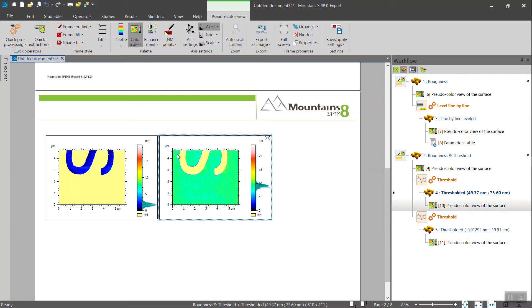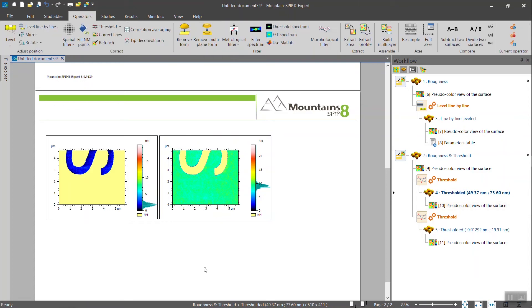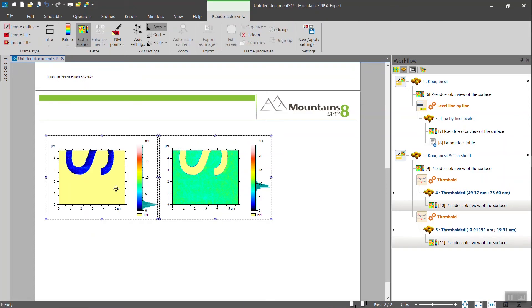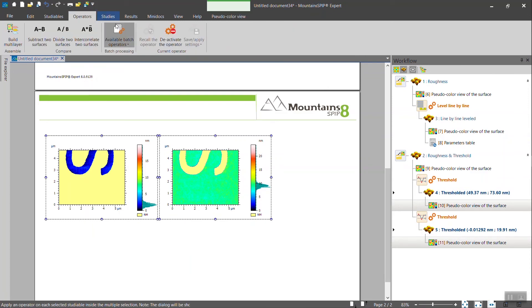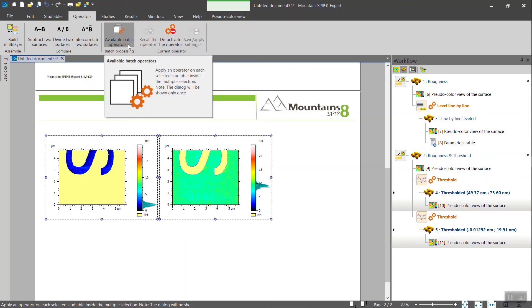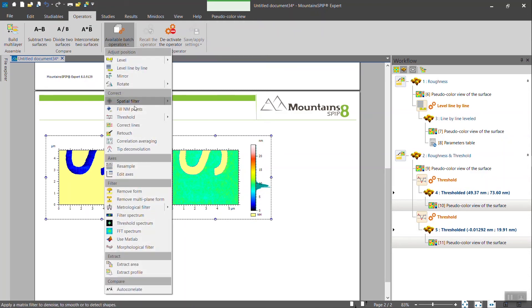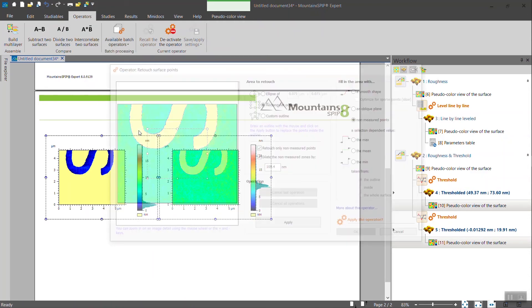To do so, we will use the retouch operator. Operators can be applied on multiple data selected in the workflow or in the document. So I will select both layers. Choose operators. And you see here, available batch operators. I will select retouch.